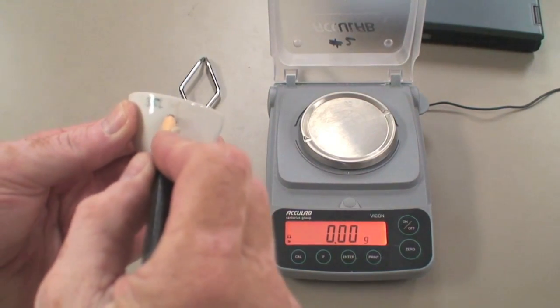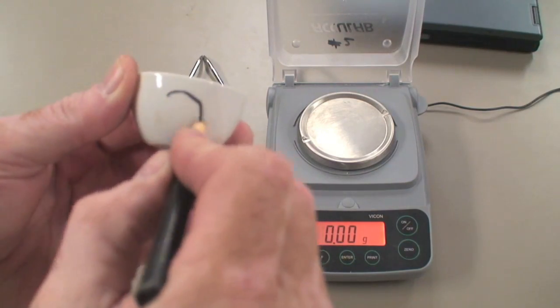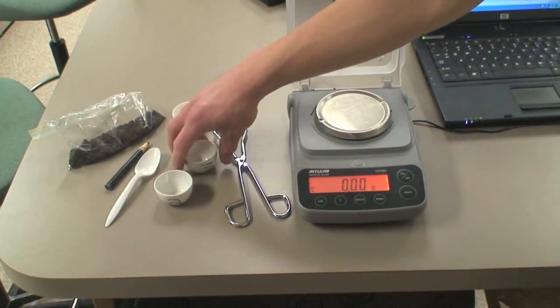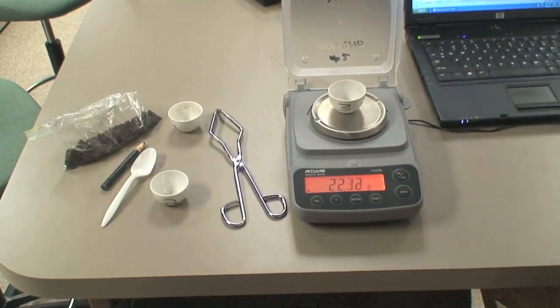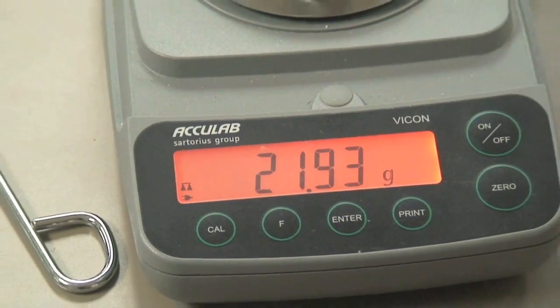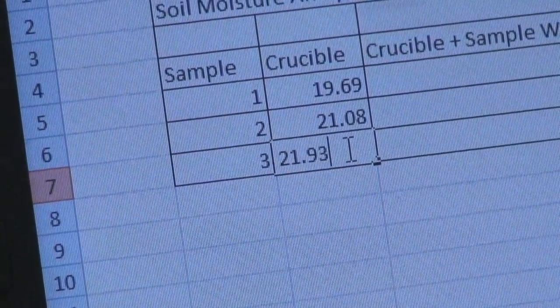To begin with, number several crucibles. This is crucial if you are to keep track of your results. Each crucible must now be carefully weighed. Make a data table and enter in the weights of your crucibles.